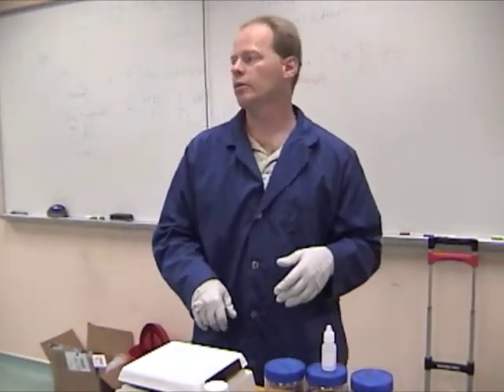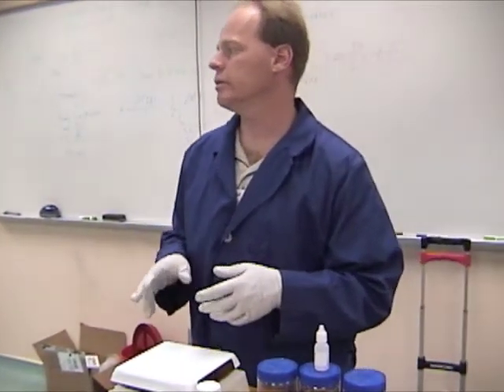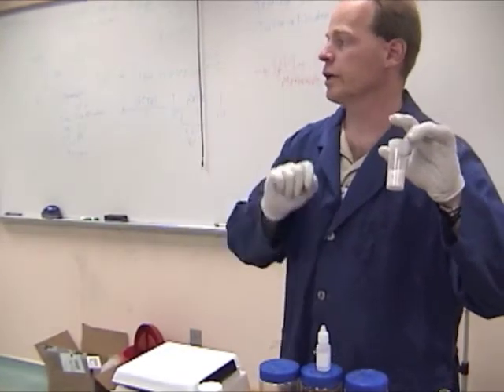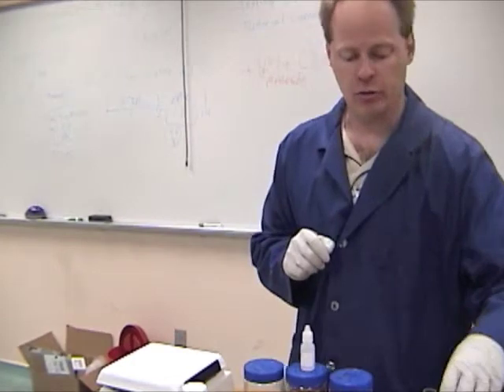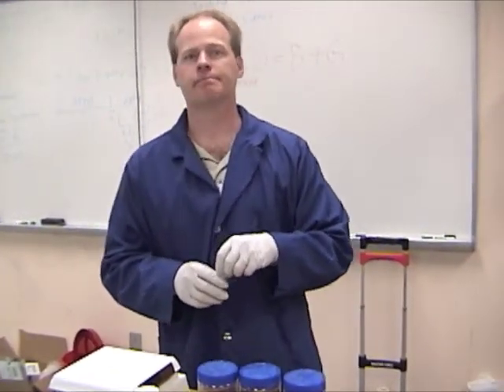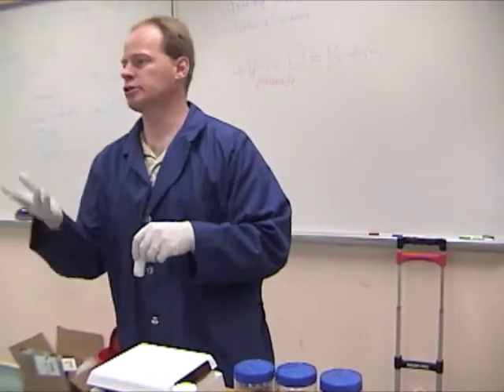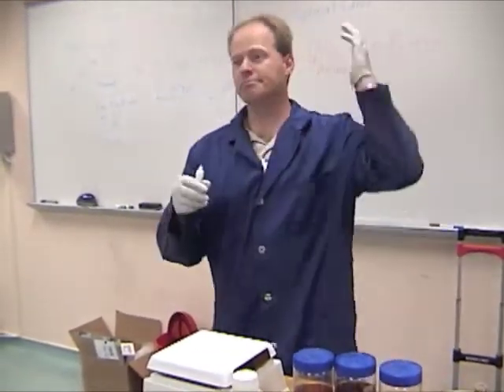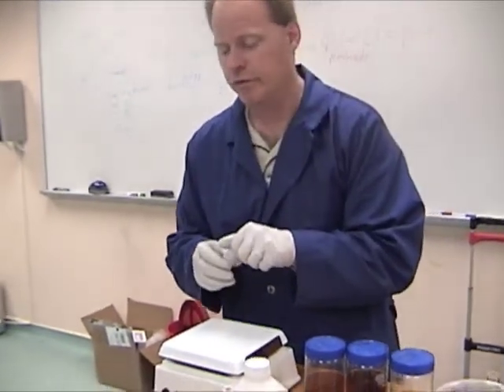You can actually walk into Walmart and buy everything you need to do a titration except your catalyst. Phenolphthalein is not in Walmart, but turmeric is, over in the spice section. Phenol red is in the pool section, the pool store. And if you can't find it, I sell it. Be happy to. And we've got some out here we can sell you.